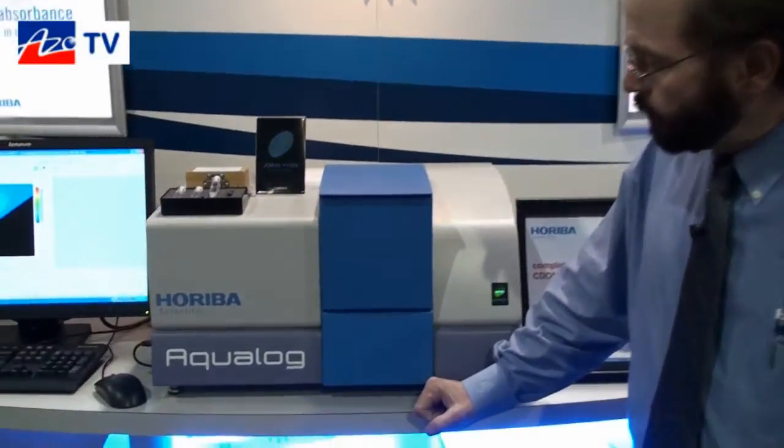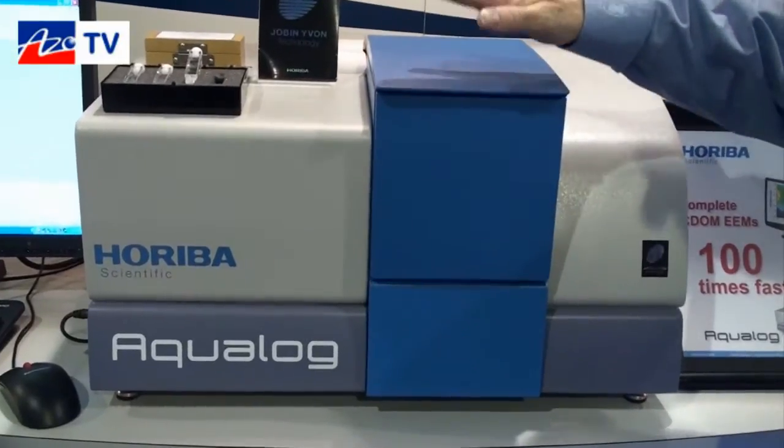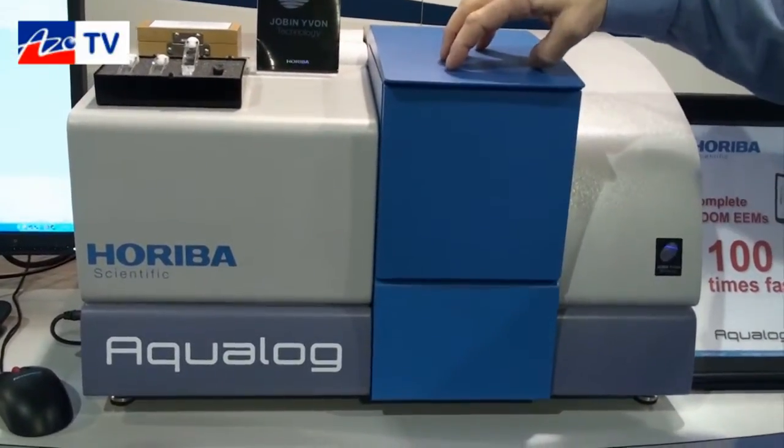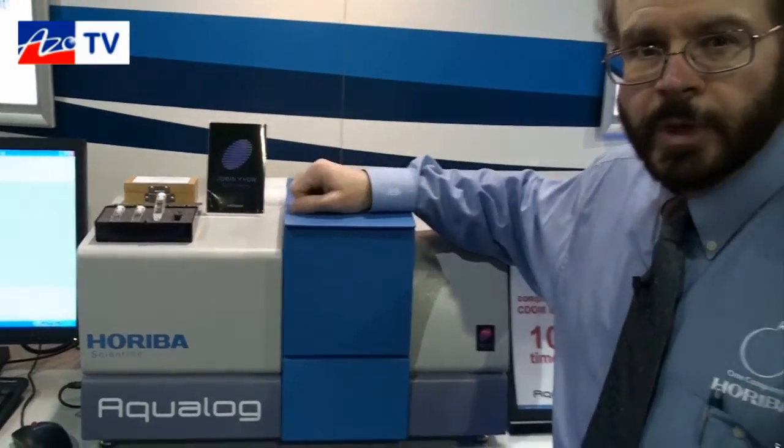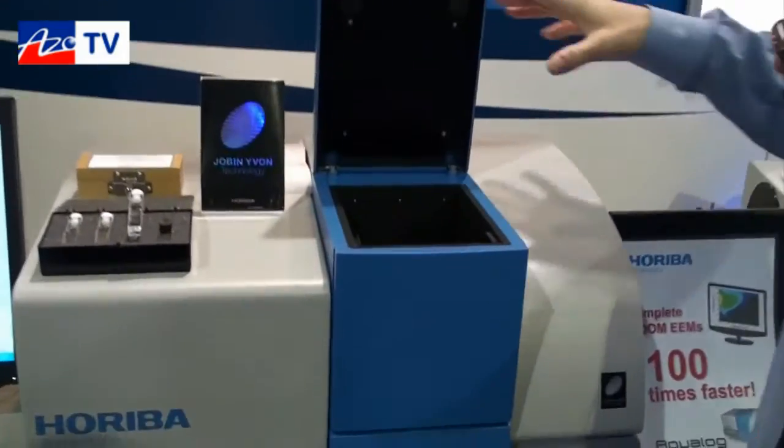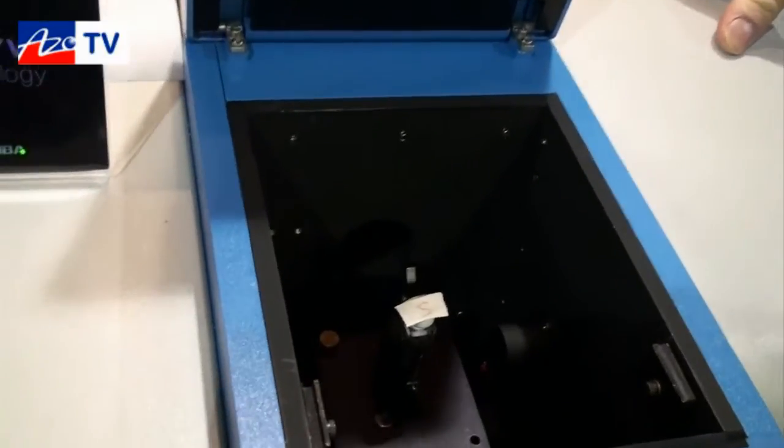Good afternoon ladies and gentlemen, this is our new Aqualog. It's a first to market release, a brand new system. It's the first system on the market that will do a true simultaneous absorbance spectrum and fluorescence excitation emission map. It's also the first system that uses a CCD as the fluorescence emission detector, so it's a hundred times faster than any other fluorescence system on the market.